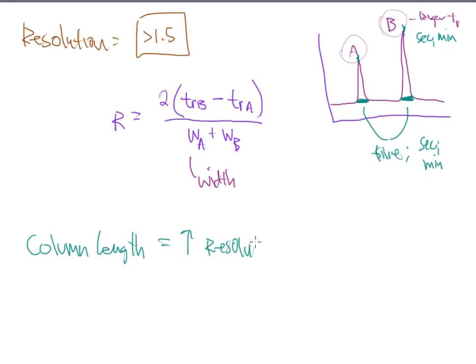And that's true. However, I told you that time is money, and sometimes we just don't want to go through the time involved in letting these things react and separate in the column, and having these hour-long run times that we might need in order for our chromatograph to be processed, right?